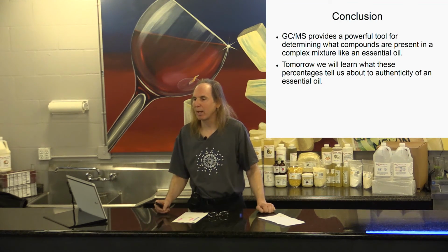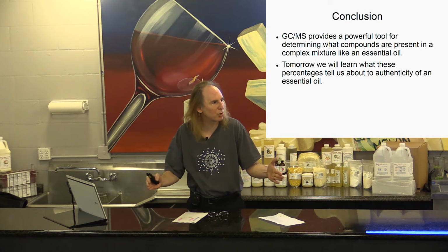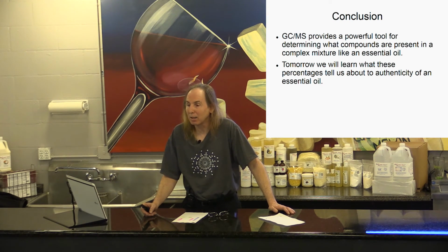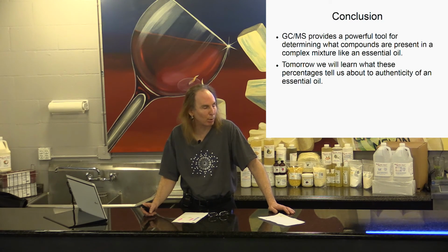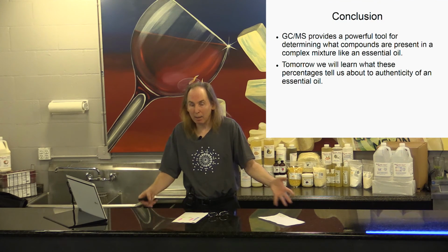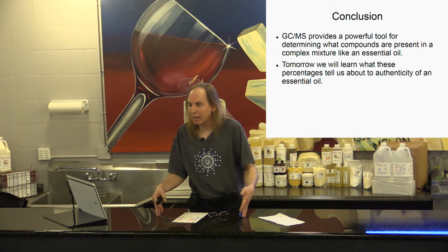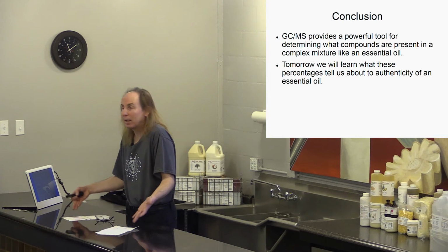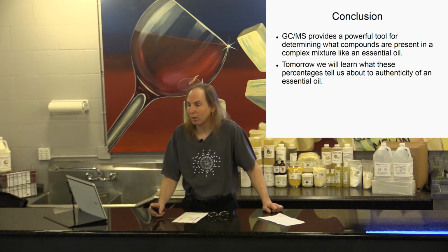The purpose of the chromatogram is to separate a mixture into its components. Look at the purple dot. I didn't mix the purple dot. I took the purple dot straight out of the pen, and yet you notice something interesting about it. The ink in the purple pen is actually a mixture of at least 2 different inks. It's at least 2, because look, we got 2 different colors there.